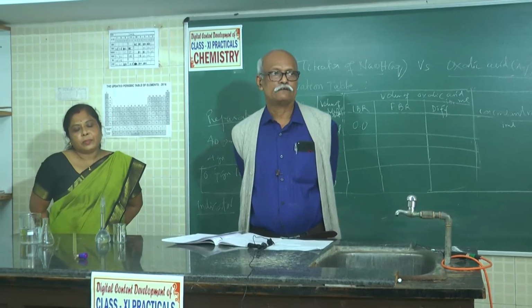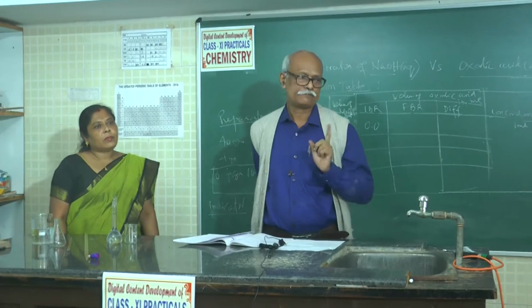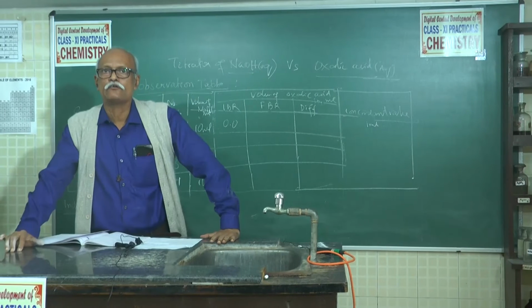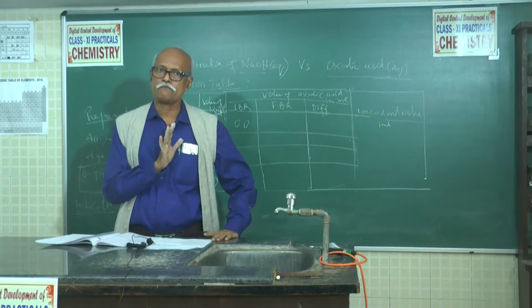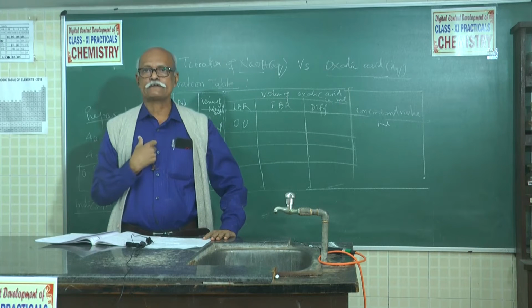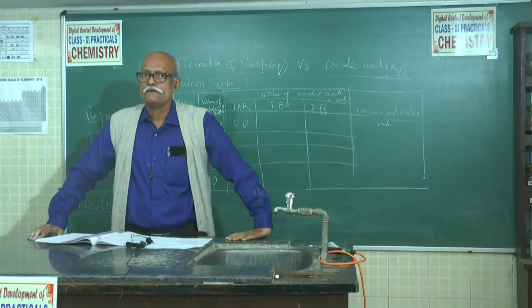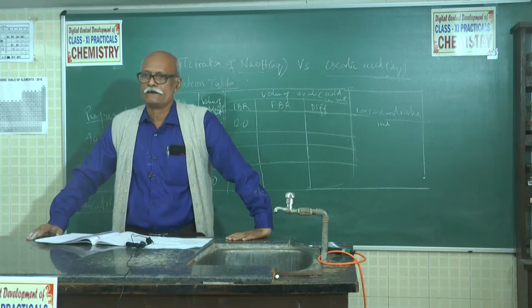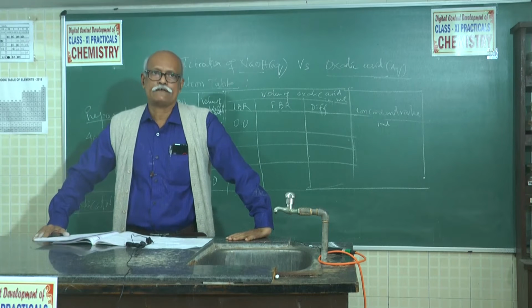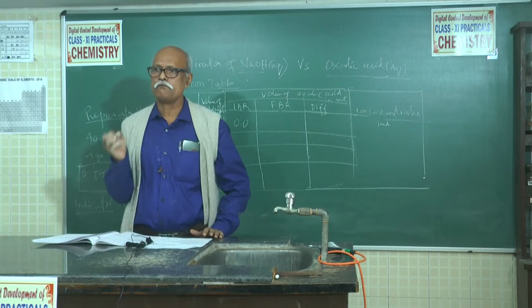In connection with the oxalic acid, now we have the standard solution prepared. Now we have to standardize sodium hydroxide. Sodium hydroxide cannot be standardized against hydrochloric acid, because hydrochloric acid is not a primary standard, so also sodium hydroxide is not a primary standard. A question is asked in the viva: why is sodium hydroxide not taken as a primary standard, but sodium carbonate is taken as a primary standard? Sodium carbonate does not decompose on weighing, its weight never changes. Understand? Sodium carbonate is a primary standard because it is a stable compound available in pure state.